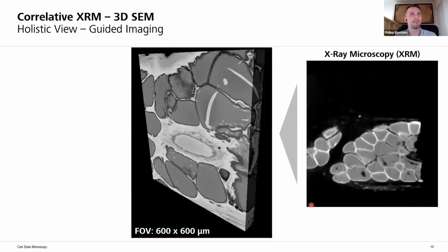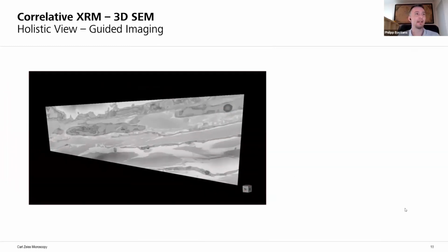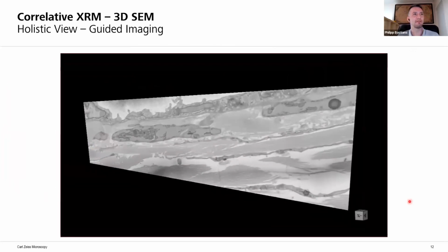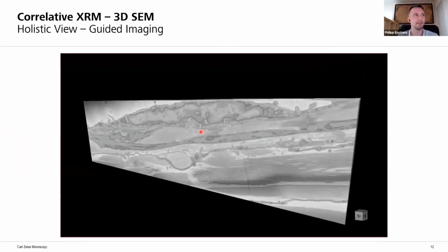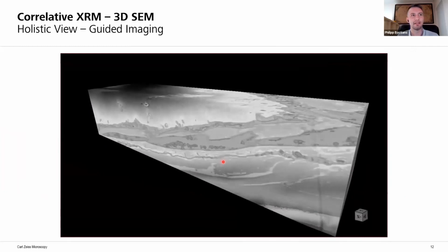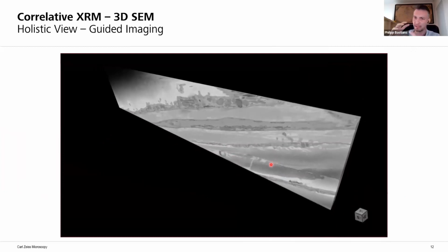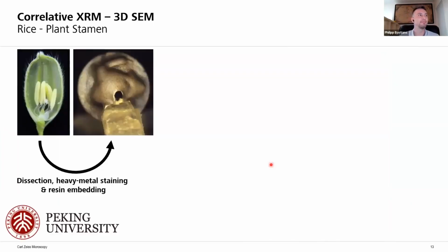That should be a video, at least the other one. Well, it doesn't play. But eventually, this is an overview data set where we also slice through and capture the whole overview. What we wanted to see is the high resolution images of the collagen network. Hopefully that video plays. It's something that you see here, right? With the endothelial cell here, and then some smooth muscles, and then the filigree and integrated complex collagen networks and bundles that you can see wave around each other to eventually provide stability to the lymphatic vessel.